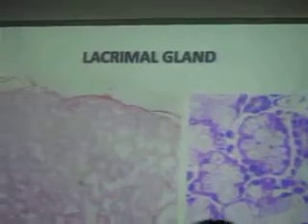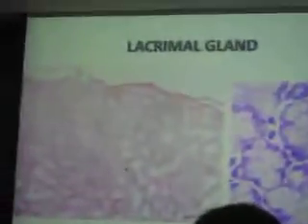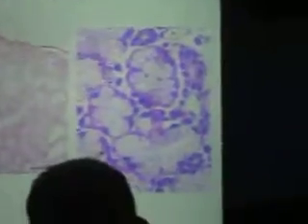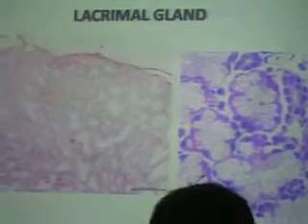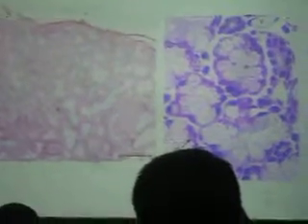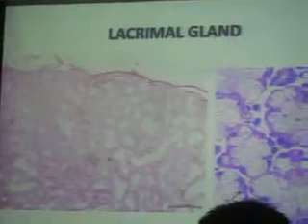And then of course the gland that's associated with the eye is your lacrimal gland. It is a compound tubuloacinar or tubuloalveolar gland. It is located superolaterally. So if we have the enucleated eye, if you see the lacrimal gland superolaterally, that could give you the laterality of the eye. Diba?